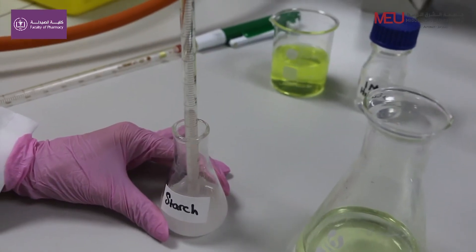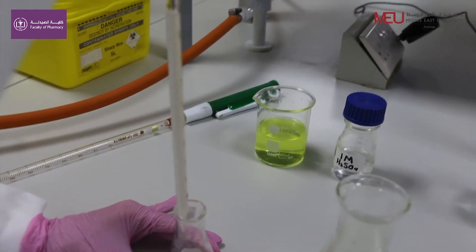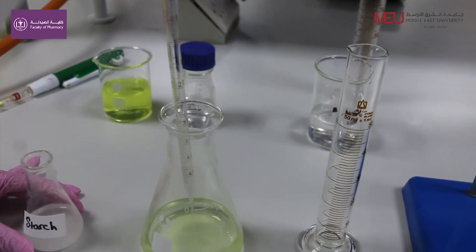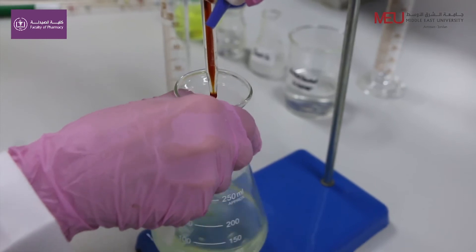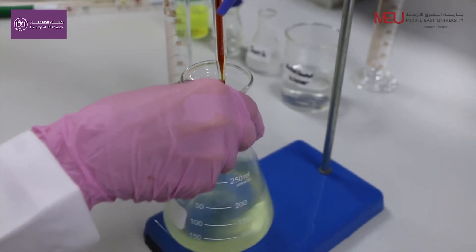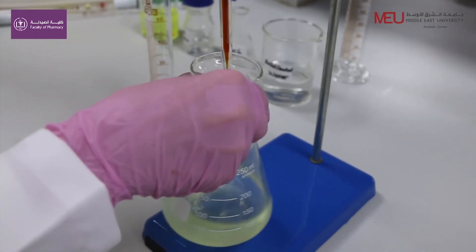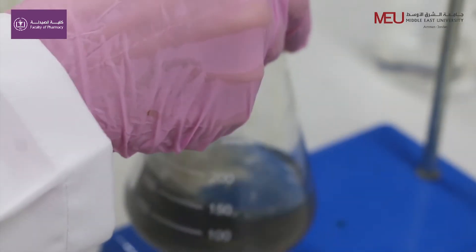Add 5 ml starch indicator. Titrate with 0.05 molar iodine solution. Record your readings and start your calculations.